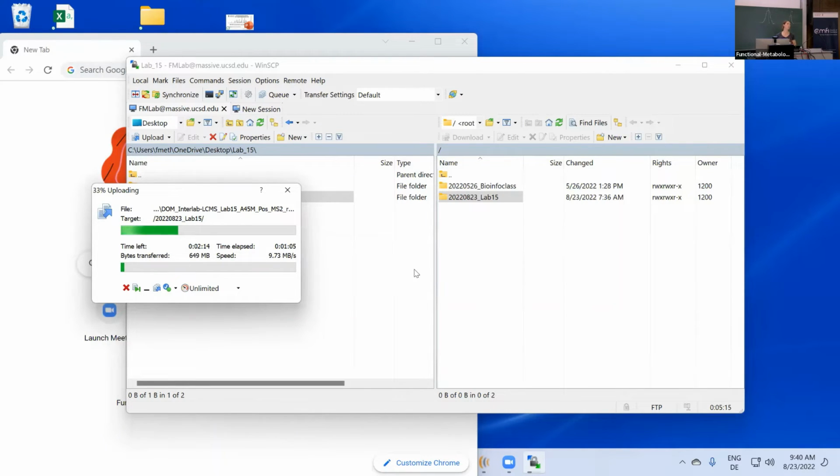So for nearly all of the post-processing or analysis steps, you'd typically be using the MZML files just because they have already been centroided, and so you don't typically do the analysis with the raw files. Yeah, so it's good to have both, basically.